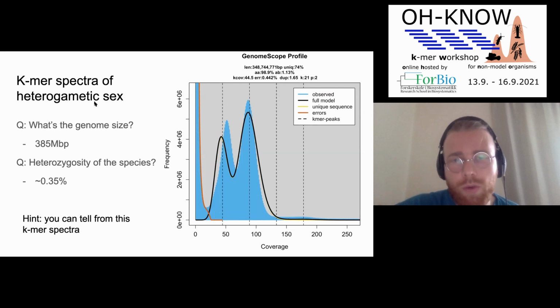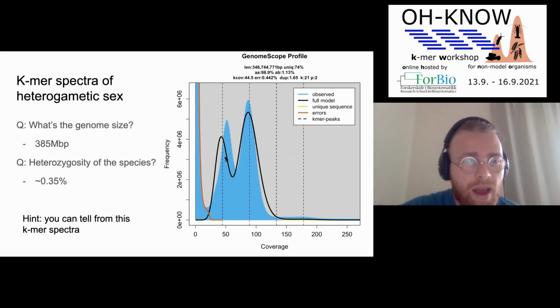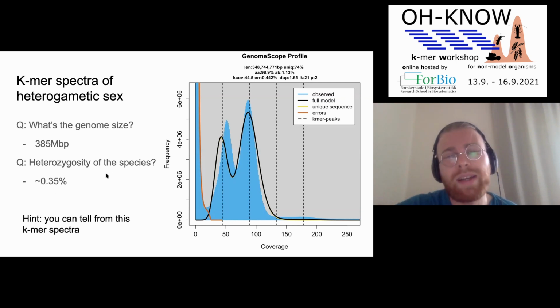the reason why I wanted to show you this picture is that when we were estimating the GenomeScope models, I was always emphasizing the need of having all the chromosomes in the same ploidy. In this case, we have a male that has one chromosome once and the rest of the chromosomes multiple times. Actually, it's two chromosomes that are there, just once. And the heterozygosity estimate is a good question, I will get there later.